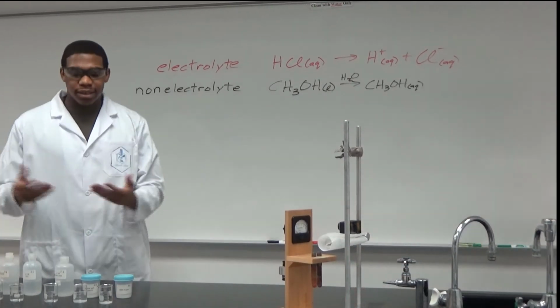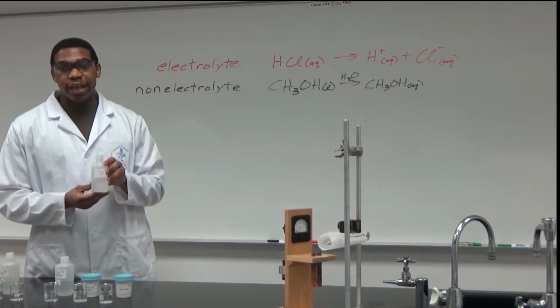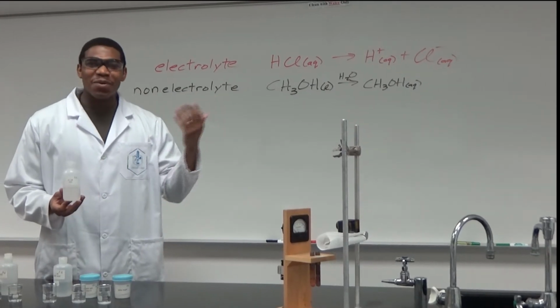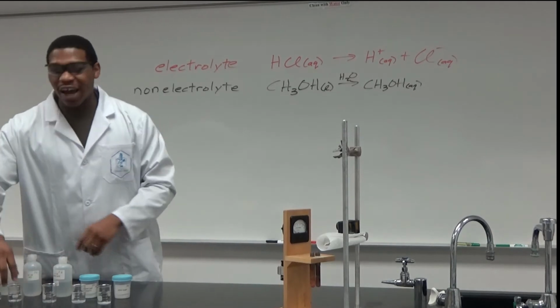All right, now let's move on to the next one. We have here what we call HCl, hydrogen, help me out here. Hydrochloric acid. I don't know what's going on with my brain today. Something's giving me a brain error. But we have hydrochloric acid here.